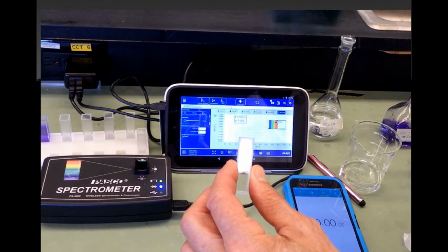To start the recording at the 10-second mark, you want to press the record button, which is the small red circular button in the lower left corner of the screen. Immediately after I pressed the record button, I also pressed the zoom full screen button, so it will show the entire plot on one screen. So let me show you what this looks like, and I'll explain a little more once we're underway here.